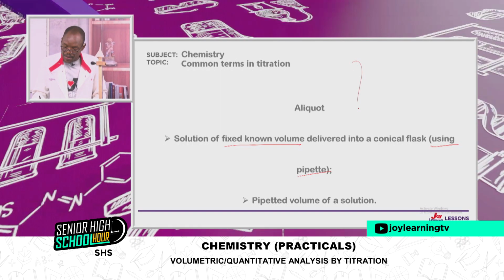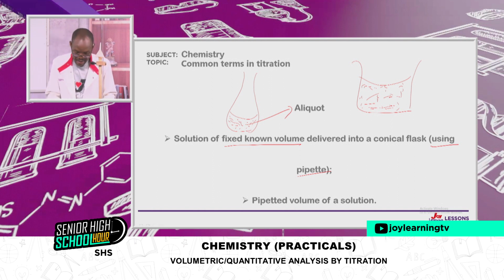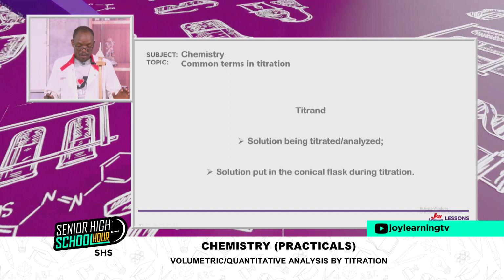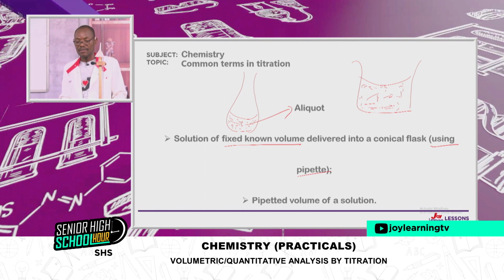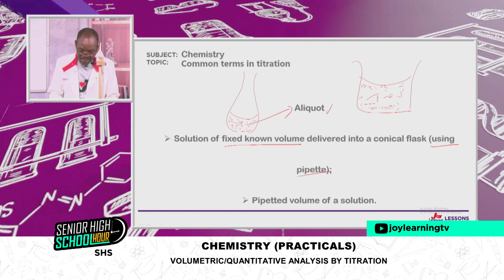So if I have a solution in a beaker like that, and then I use the pipette to take a solution into a conical flask, that becomes my aliquot. Then we can have a titrand, the solution being titrated or analyzed, or the solution put in the conical flask during titration. So the moment I place it into the conical flask like this, it becomes the titrand because I'm going to titrate it against the solution in the burette. If it is not being titrated, then you can say aliquot. The moment I'm going to titrate it with the solution in the burette, it becomes a titrand.